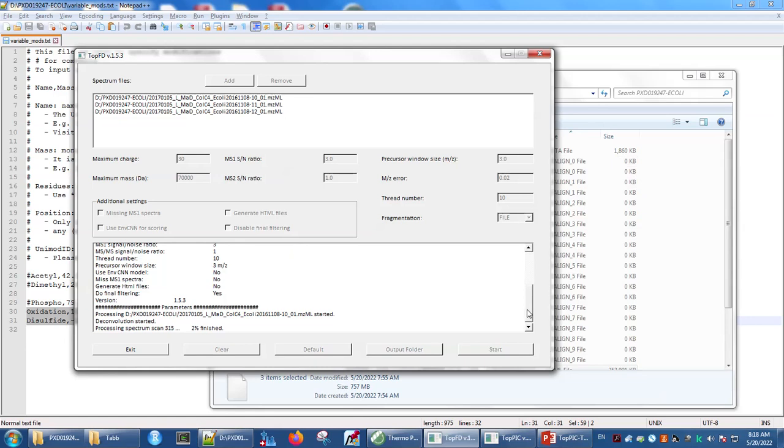In the old days, when we had mostly single-core computers, this kind of process could take all day. But the fact that I have 10 processor cores to distribute that work across makes this run much faster.